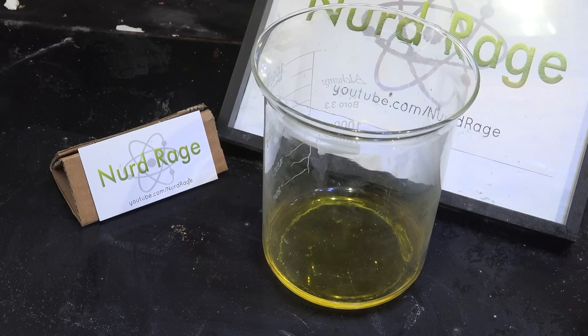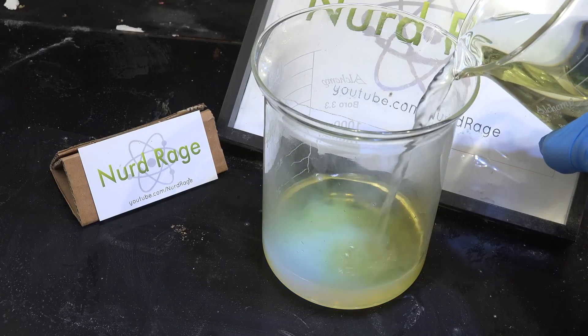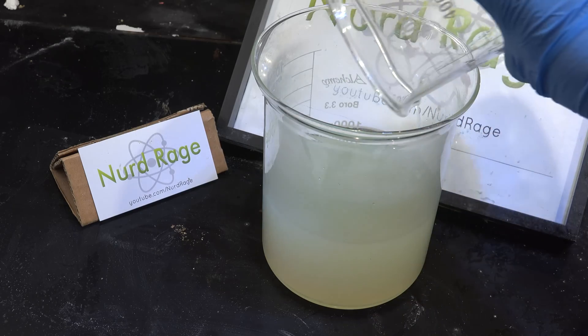A special note on waste disposal: this solution of sodium polysulfides will release hydrogen sulfide if mixed with acids. To render it safe, I recommend adding in half a liter of bleach to oxidize the sulfides to sulfur and sulfates.